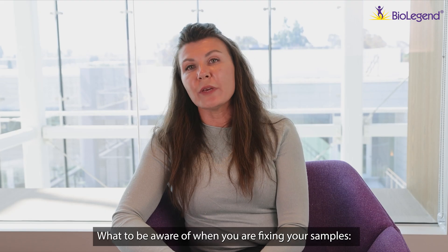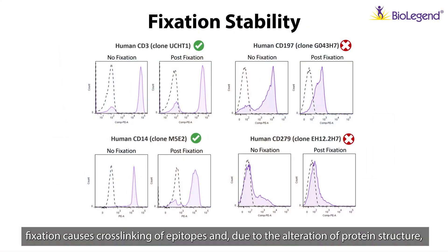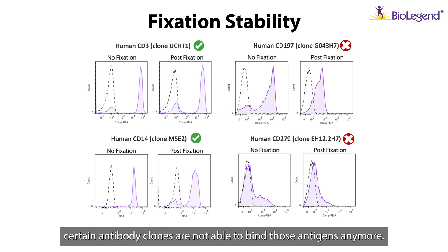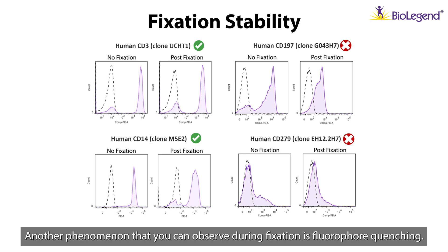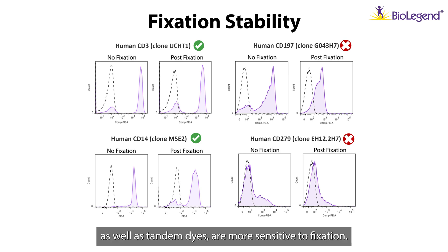What to be aware of when fixing your samples: fixation causes cross-linking of epitopes, and due to the alteration of protein structure, certain antibody clones may no longer be able to bind their antigens. Another phenomenon observed during fixation is fluorophore degradation — protein-based dyes as well as tandem dyes are known to be more sensitive to fixation.